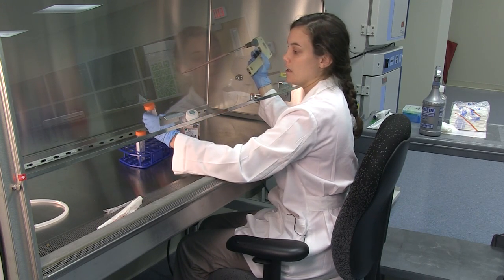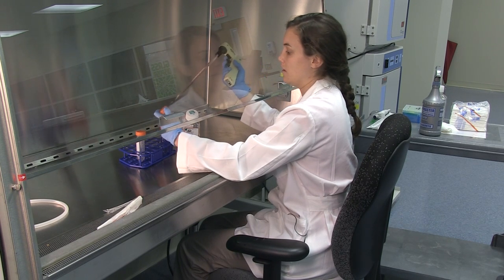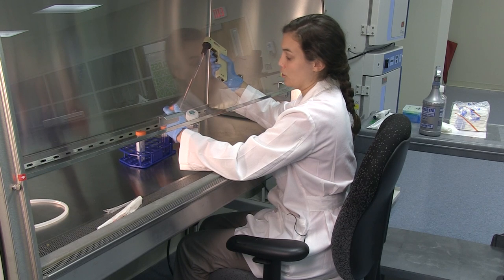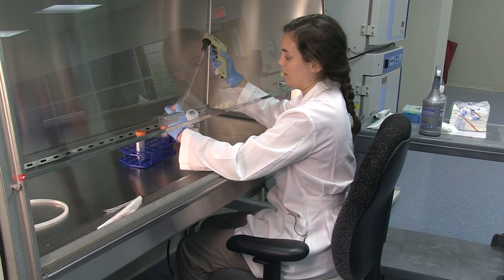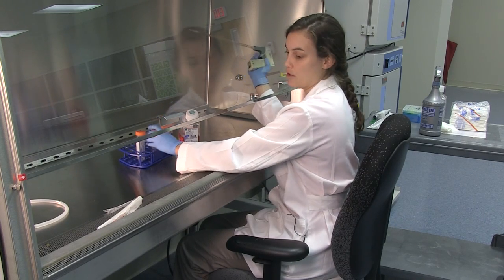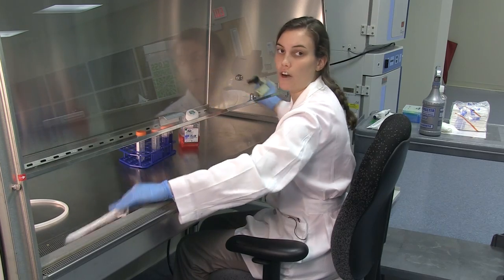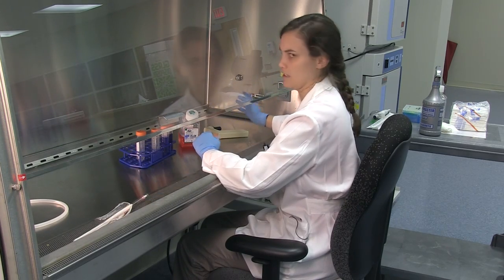Then with the other hand, you can take the cap off this media bottle or tube and transport your media. When you're done, put your lid back on. If you're done with your pipette, you can put it away or discard it.